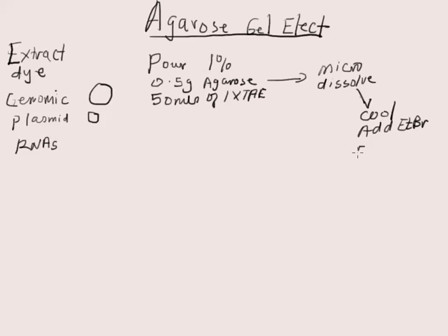Then add ethidium bromide — that is provided for you — to a final concentration of 0.5 microgram per ml of gel. Take that and pour it into the gel mold that you have set up, and let it polymerize to become solidified.